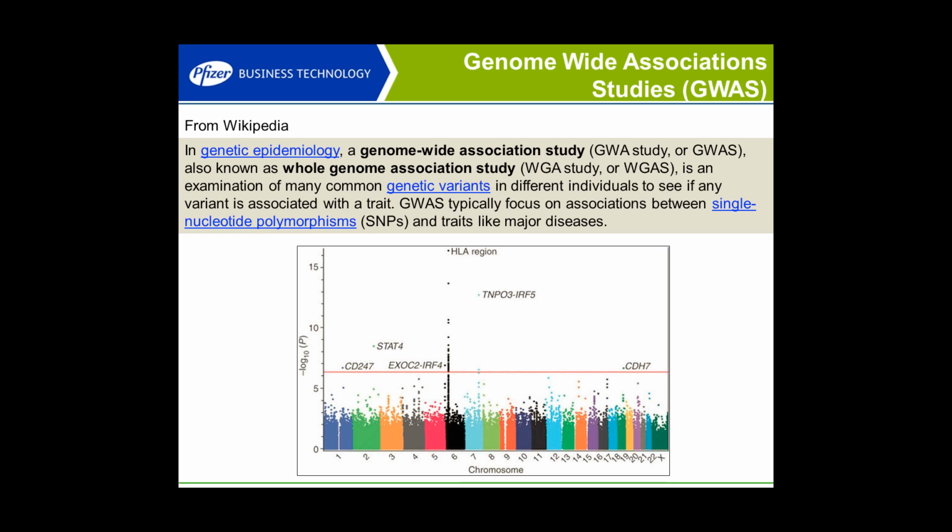And fundamentally, one of the ways to visualize these is looking at a Manhattan plot, which is described here, where chromosome positions are on the x-axis and a negative log p-value. So the p-value of the difference essentially between the odds ratios for each cohort, for each individual variant.